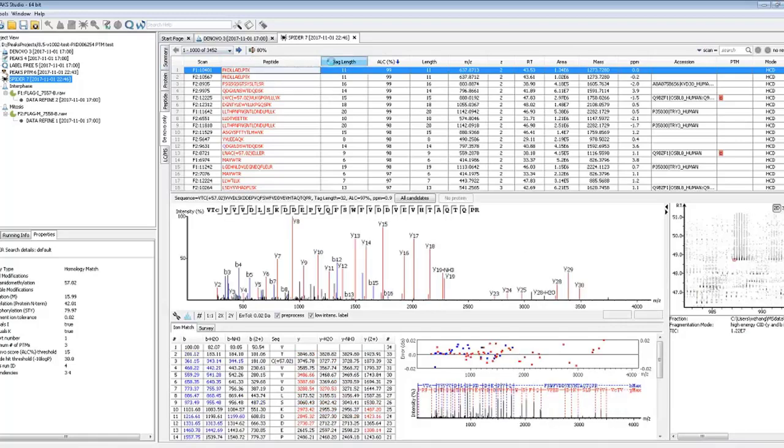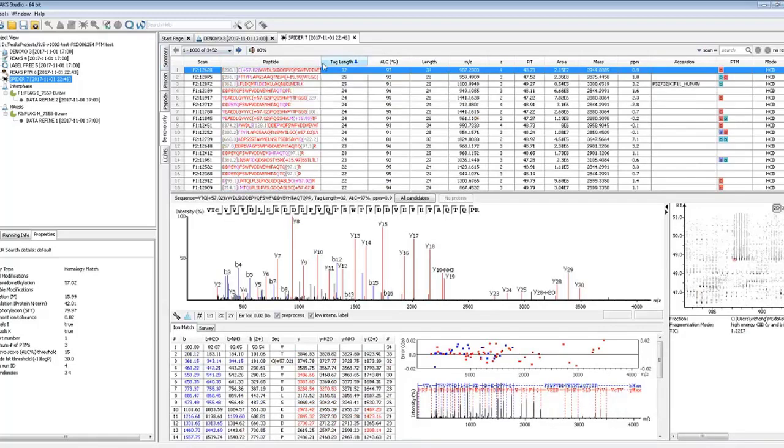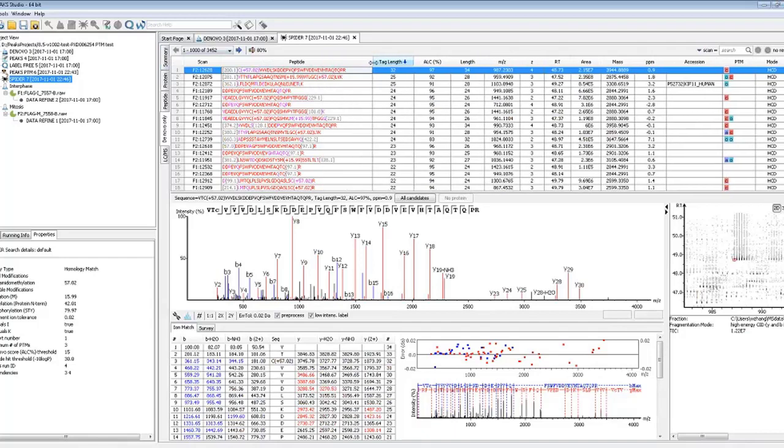These are really interesting peptides because they could not be matched by the database search. That leads you to the question, what is the actual source of these Denovo sequencing results? These could be PTMs that were not considered in the initial database search. They could be mutations that are longer than single amino acid variants. It could be from proteins that weren't included in the database. There could be lots of factors that could cause a good spectrum to not be matched.